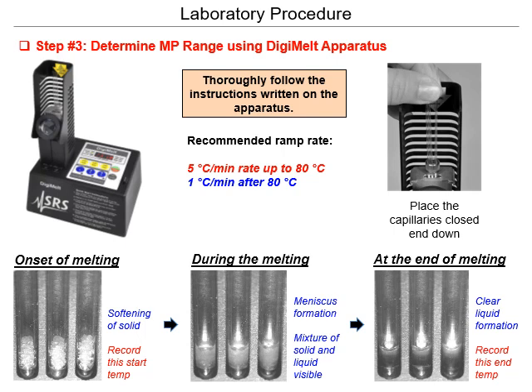All right, once you have your 5 specific capillary tubes all ready to go with your substances inside of them, you're going to turn on the Digimelt apparatus, which we show here on the upper left. That's what it looks like. At the very top left, you notice the little eyepiece. That's where you look to see the things melting, and you can see there's 3 capillary tubes in it. That very top metal part there under the grate, where that yellow arrow is pointing down, has 3 holes where you can put capillary tubes down in there.